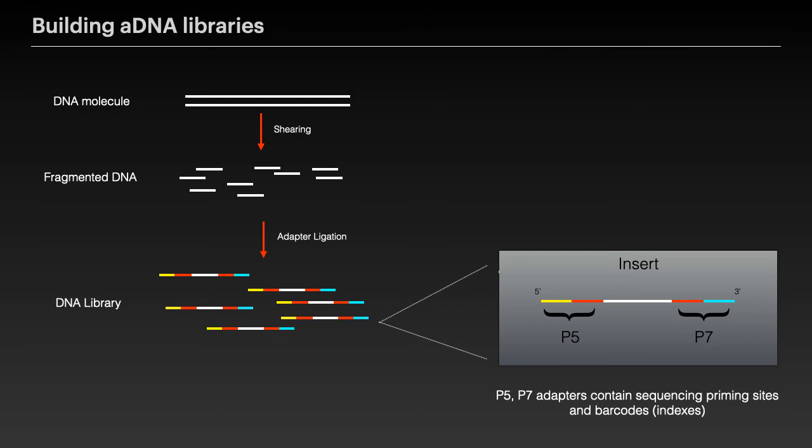So under the same idea here, as with the extraction methods, there have been two widely used library construction protocols in ancient DNA, and one has been optimized specifically to deal with problems arising from ancient DNA properties.